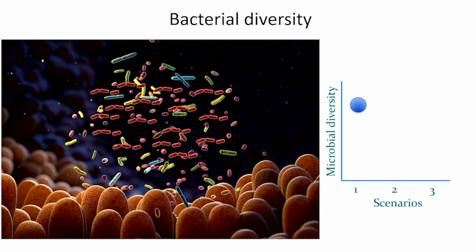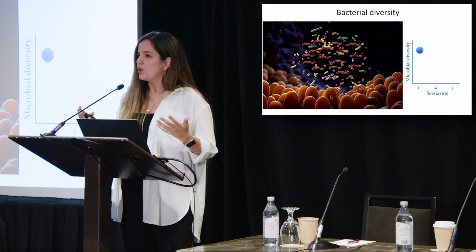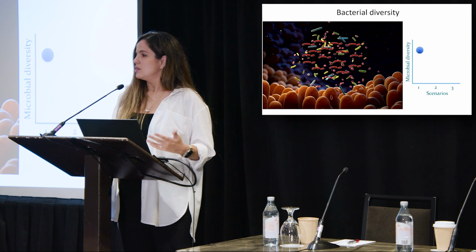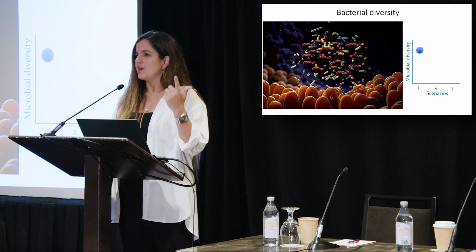We bring all these samples, all this information to the lab, to our computers, and we start to apply different pipelines for bacteria identification. And we have two goals mostly for that. We want to check specifically for diversity, and Dr. Mathur already mentioned that diversity is an important feature of the microbiome. We want to know how diverse is the small bowel microbiome, how diverse are the stool microbiome. And the second thing that we do is profiling.